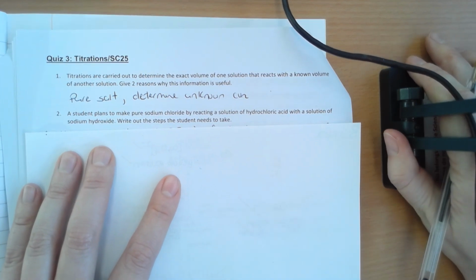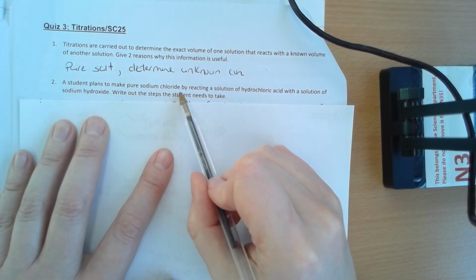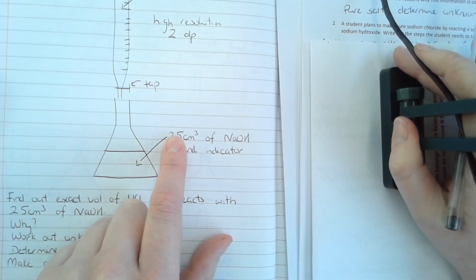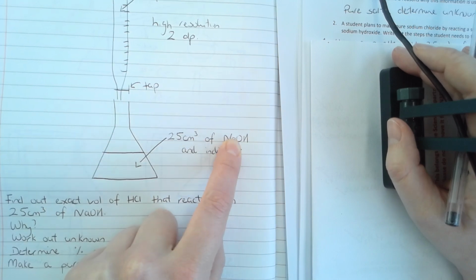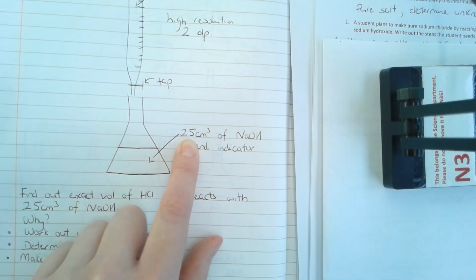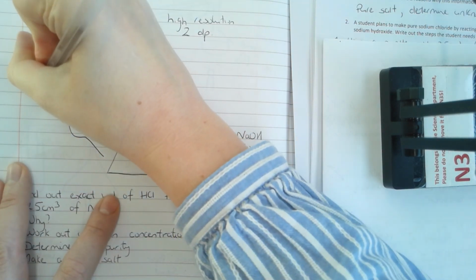All right, but the next bit here, this is a potential 6 marker. A student plans to make a salt by reacting a solution of acid with a solution of base. Write out the steps they need to take. Okay, first thing we're going to talk about is how we're going to get exactly 25 centimeters cubed of one of our solutions into the conical flask. This has to be done super accurately. A beaker is not going to cut it, neither will a measuring cylinder. You need to use a piece of glassware called a pipette.